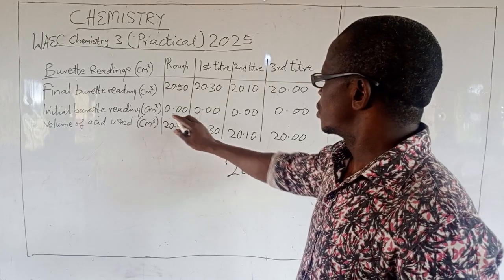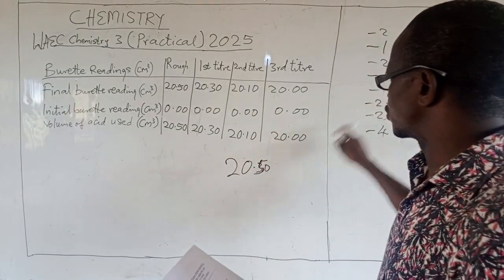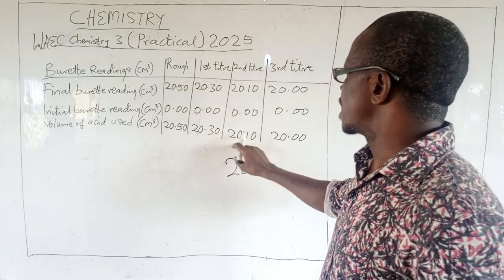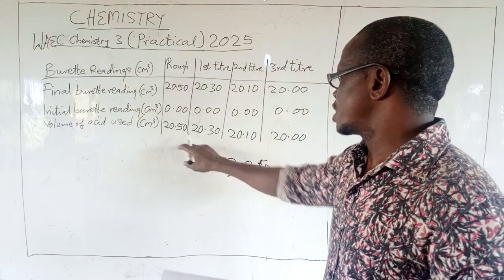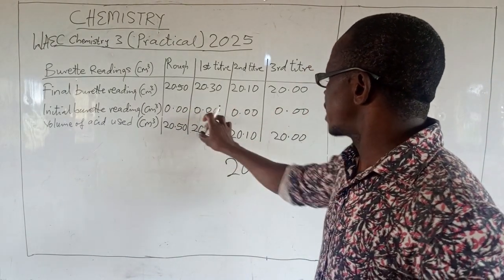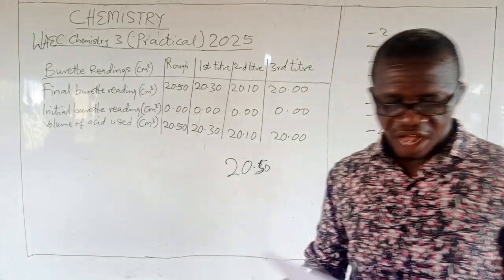You lose 1 mark. You did not record this, 1 mark gone. Times how many places? 2. Why is it 2 that we are talking about? Because the examiner will only mark 2 of these, not all. Only 2 sets. Either these two or these two or these two, any 2, based on the ones you are using in your average titre.